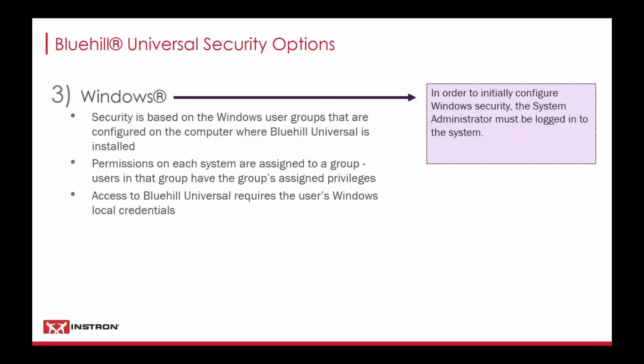So at least in my case, I'm using my Instron work laptop right now. And although it's my laptop and my user account is on this, I'm actually not the system administrator of my own PC. My IT department's the system administrator. So if I wanted to configure Bluehill to use the Windows login, I actually wouldn't be able to do that because I'm not the system administrator.